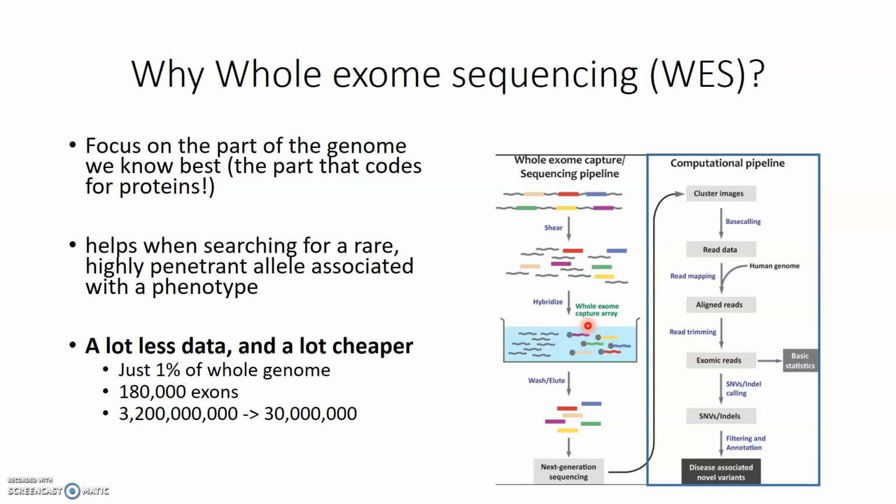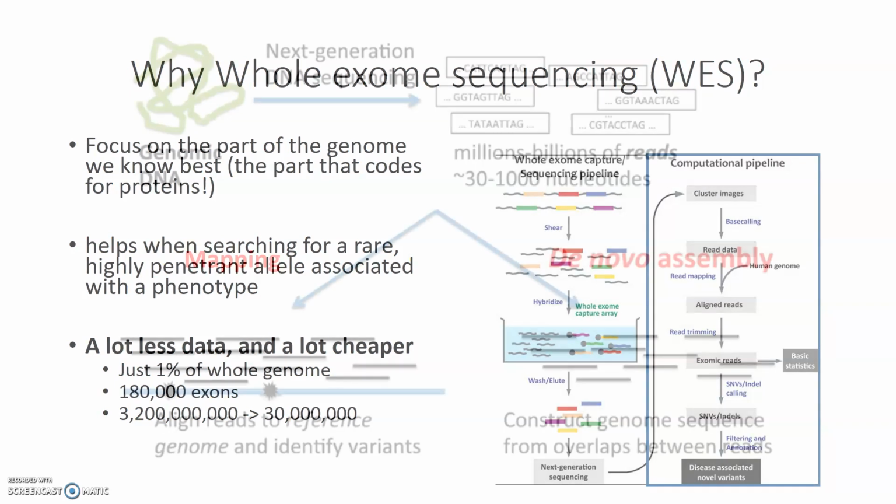We're going to basically have what's called a variant caller program tell us where our sequences in our FASTQ files differ from that reference, and then we're going to characterize those genetic variants somehow and try to determine where the disease-causing variation actually is in the genome.